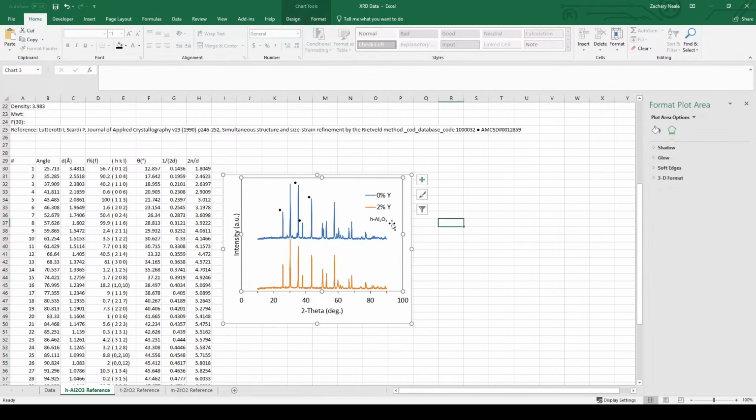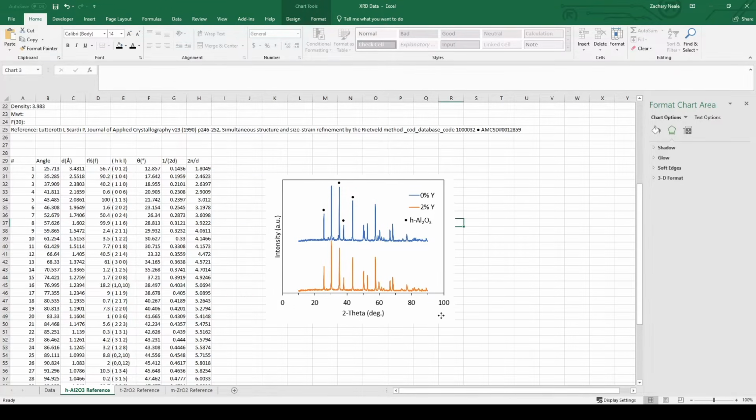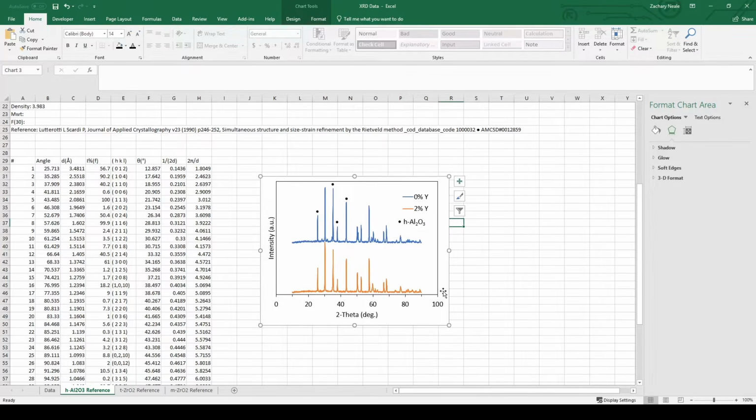Alright, oops. Make this the same size font, 14. Okay, and then we can add the shape to the legend. Okay, like this. Okay, so that's about right. So now you can add the other phases using the same method with a different shape.